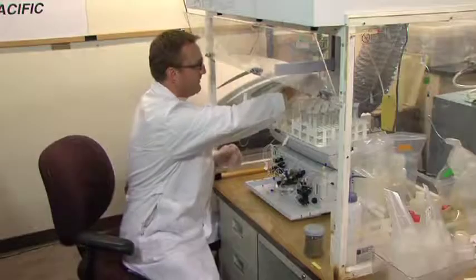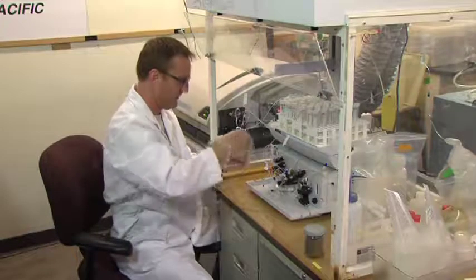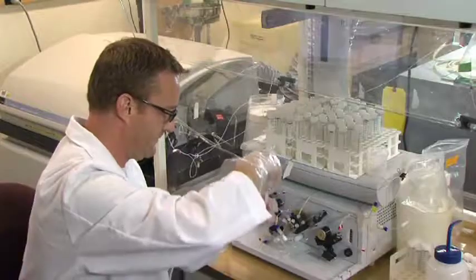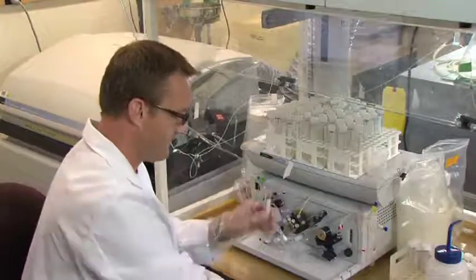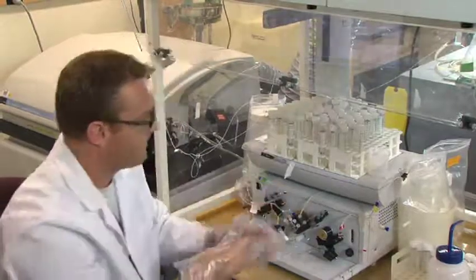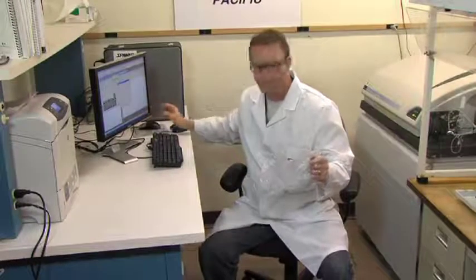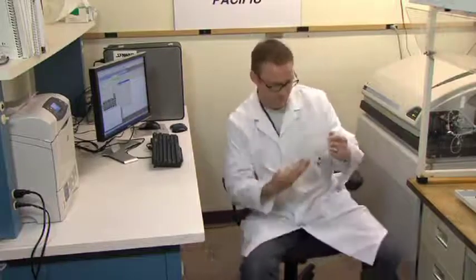Here in the inorganic laboratory, various wet chemistry tests are performed, such as pH, flash point, oil and grease, ammonia, and biochemical oxygen demand, or BOD. In addition, metal samples may be digested in this area. Our soil samples will be analyzed for lead using this inductively coupled plasma mass spectrometer, or ICP-MS instrument.